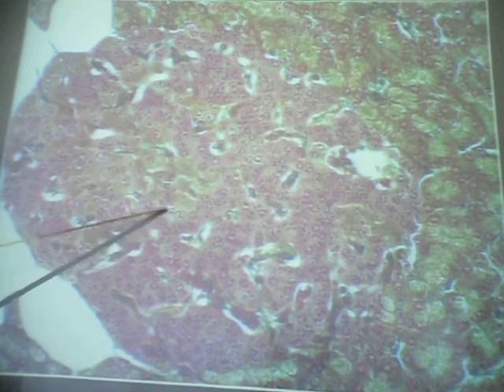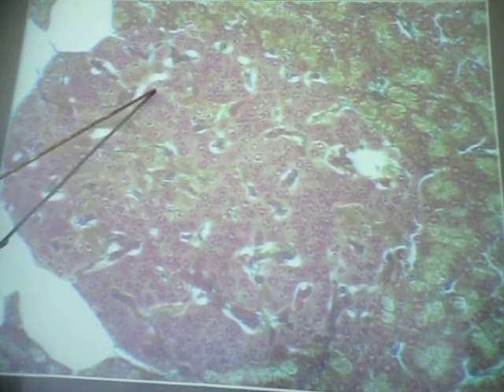So here we are again. It's the delta cells, okay? These were a light brown cytoplasm, as you see here, tan colored, that also produce somatostatin. Now, soma means body. Statin means basically stop or hold in check. What this does is basically stop the secretion of many other glands in the body, including the secretion by the alpha and beta cells of insulin and glucagon. It also inhibits secretion of gastric juice, various pancreatic enzymes, and so on. So it basically shuts down secretion of a lot of things.